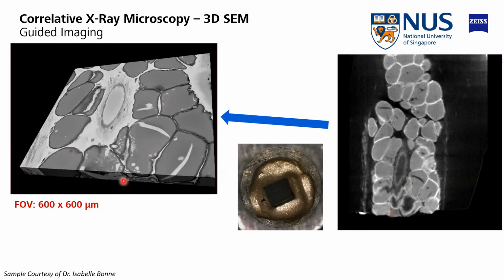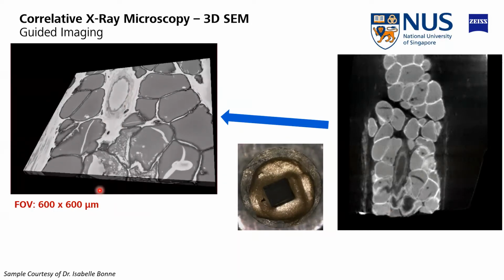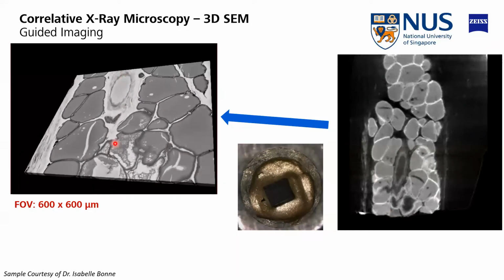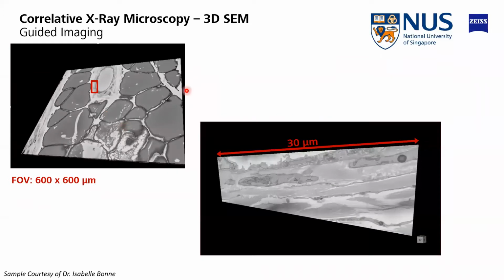And of course, sorry for that, this is three-dimensional data. So we're running through the data set here and see how the vessel eventually moves to one of the borders of the images. And this is, of course, very low resolution. But at the end of the day, we want to have a high resolution data set. So we image here one of the borders of that lymphatic vessel.